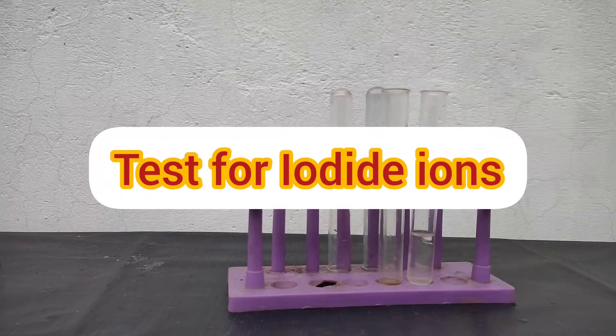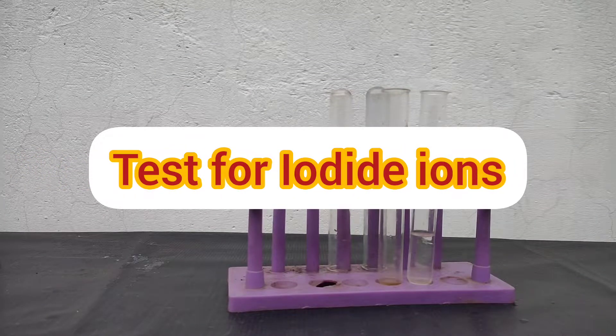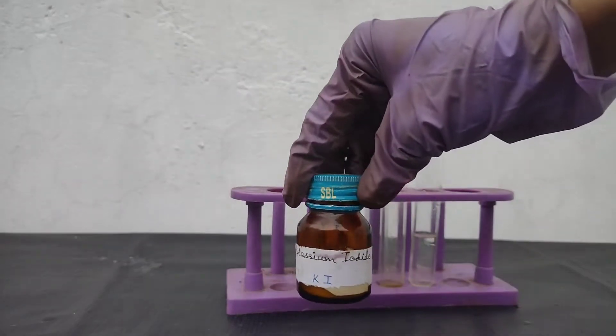Hello friends, so in this video I will be showing you the test for iodide ions. So for that I have a salt, potassium iodide.